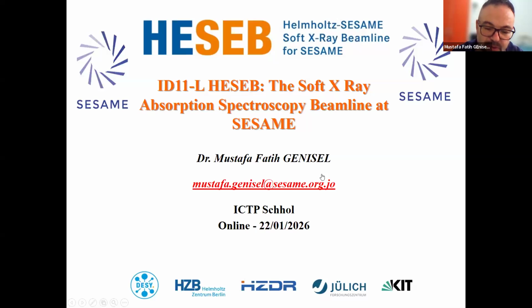I kindly invite you to use HESEB. Soft X-ray absorption spectroscopy is not, I don't want to say well known, but mostly people work with XPS. But again, if you are working with catalysis, batteries, or photovoltaic cells, it gives you very nice data about the electronic structure, which is important in many, many areas.